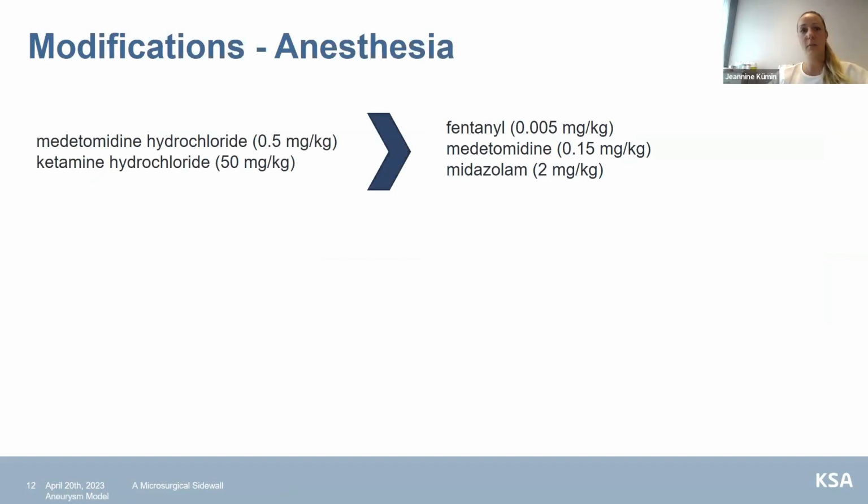So let's now talk about the modifications we did over the last 10 years. The probably biggest change was the anesthesia. We started about 10 years ago with intraperitoneal anesthesia with medetomidine and ketamine, which gives us an approximate surgery time of about 45 to 60 minutes.